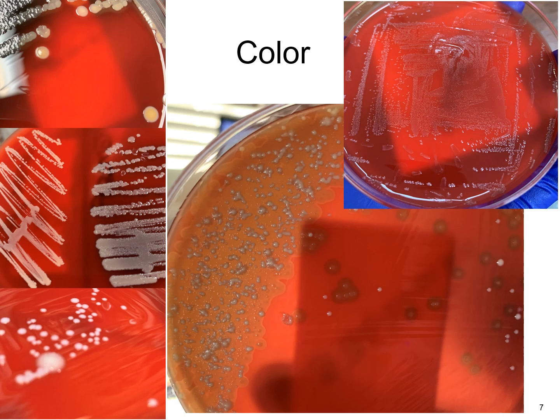When we look at color, again, you have that hemolysis of the agar here, but these organisms are kind of grayish, transparent, and then you have some that are white. These colonies up here at the top all have a whitish gray look to them.